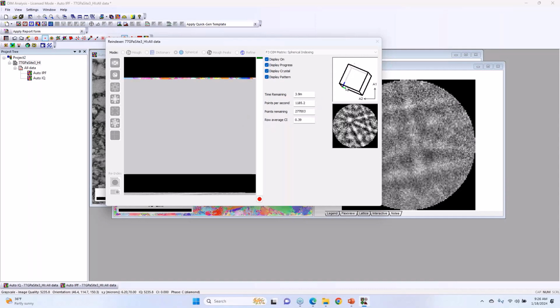So, as it goes, you'll see, this is a legacy thing from when our scans used to go in points per second, and you could actually see it. These are pretty nonsensical displays to have, but whenever we've taken them away, people said, where did it go? So we've left them in there.